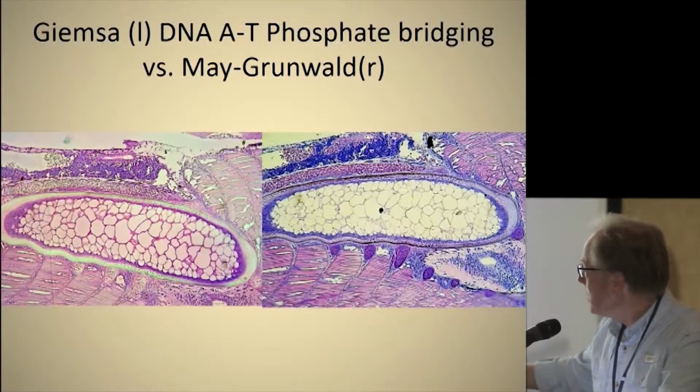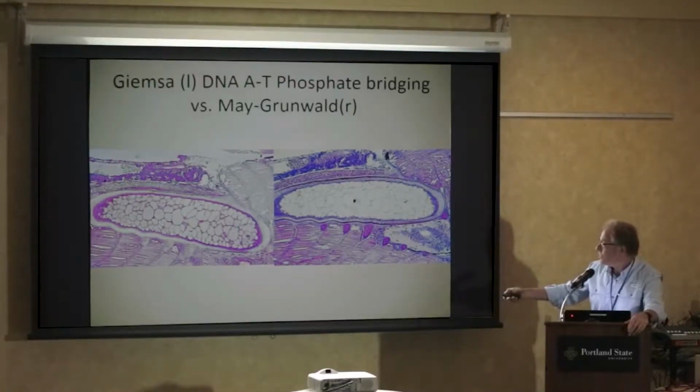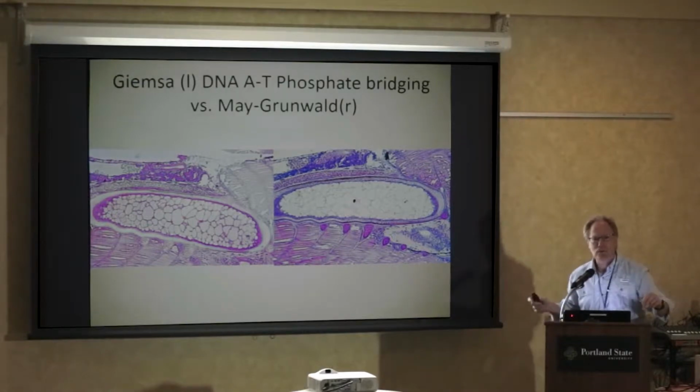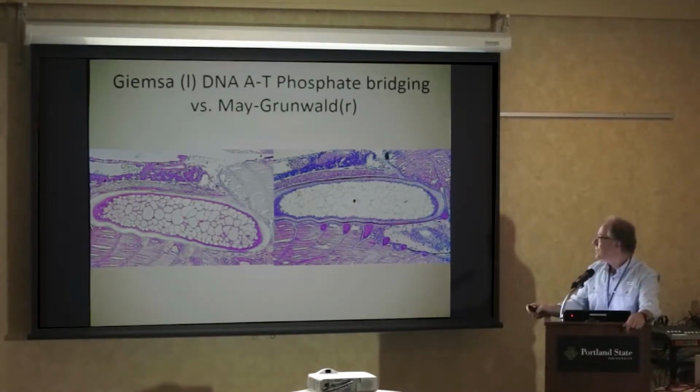So now you have a really clear distinction between what is muscle tissue, what is cartilage, what is an ectodermal and a mesodermal layer. And I'm not really sure what's going on here, but I think that's probably just, as we call it, a fixation artifact, which means we don't know, or it could be a basal lamina. But again, a lot more visual data.